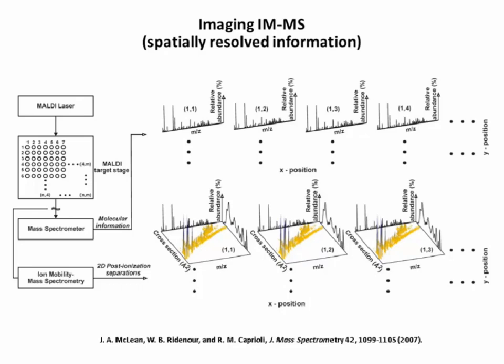So what I'm showing here on the top is that in a typical mass spectrometry imaging experiment, you generate a matrix of mass spectra. On the bottom, what you generate is a matrix of matrices. But what it allows you to do is combine a separation strategy, much like liquid chromatography, at each spatial pixel location. And so using these approaches, what we tried for several years to do is to use that to image under high vacuum conditions cell cultures.